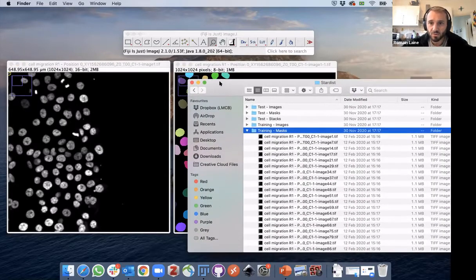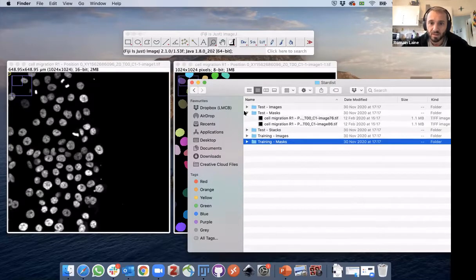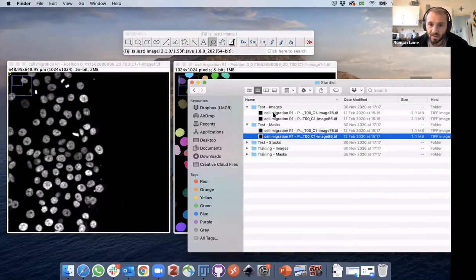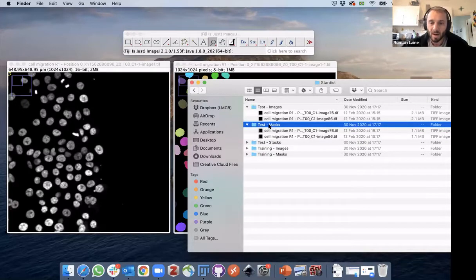Another thing that's important to talk about in the data that we have provided is we've also set aside, as part of that pre-curated data, and for which we have the ground truth, a bit of data set. So what we call test data set right here, test images and equivalent test masks, where we've set aside completely, and the neural network will never see that during training. That's never provided during training, and we'll be able to use this for quality control.